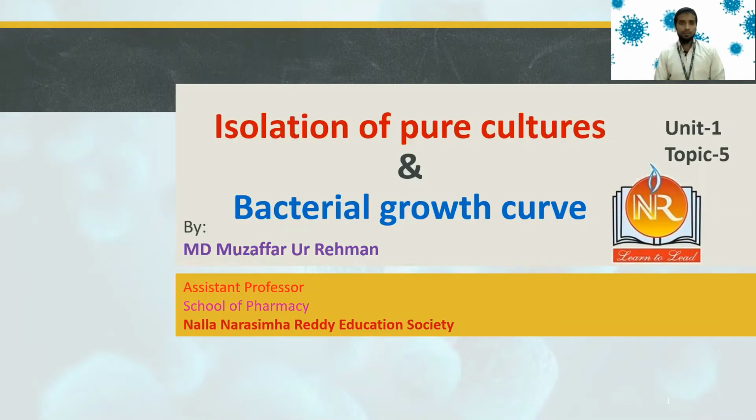So first they'll be taking a solution of a bacteria or the solution having the bacteria or bacterial cells, then that will be added to the culture media, and then they will put it for incubation in order to grow that. So there are various techniques of isolating the bacteria after their growth in the culture media. So in today's class, we'll be studying about the isolation of pure cultures and bacterial growth curves and how the bacteria are increasing in the culture media.